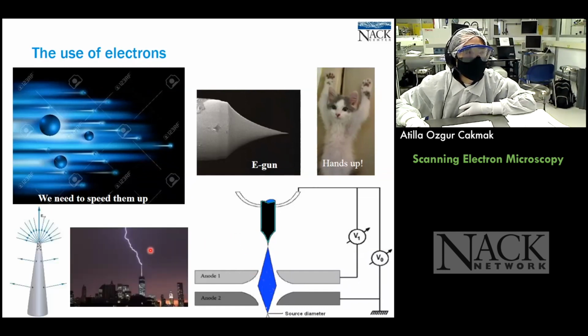So this is what we call the lightning rod effect. What you do is you try to create a very thin surface or an object so that the power supply that you apply, these are power supplies, nothing really fancy, will create what we call an electric field.